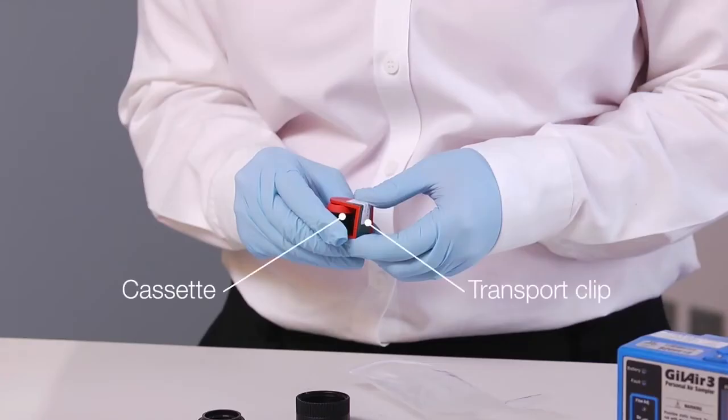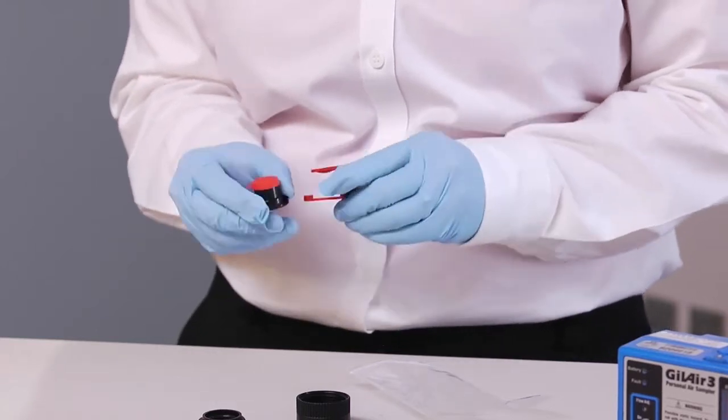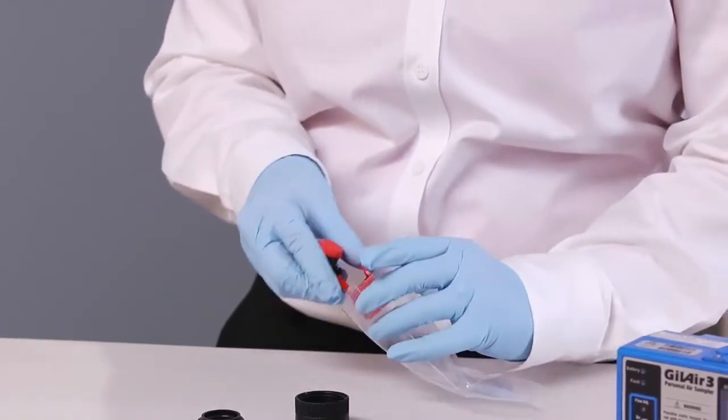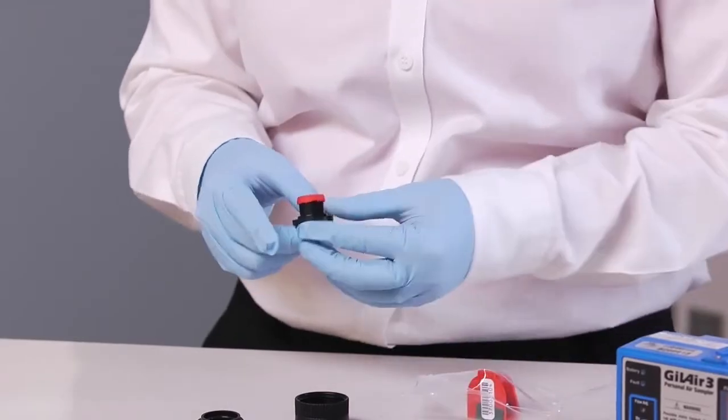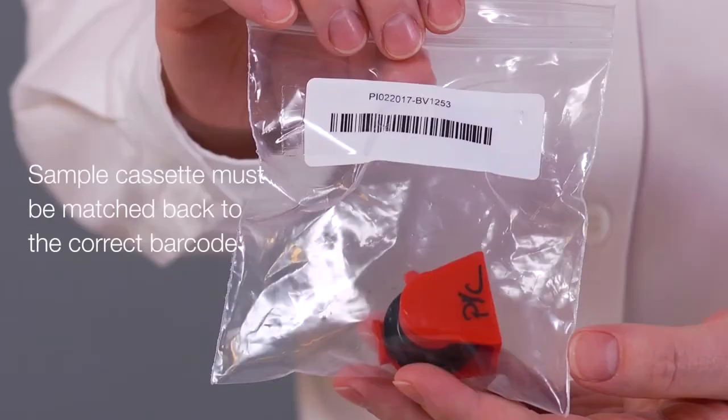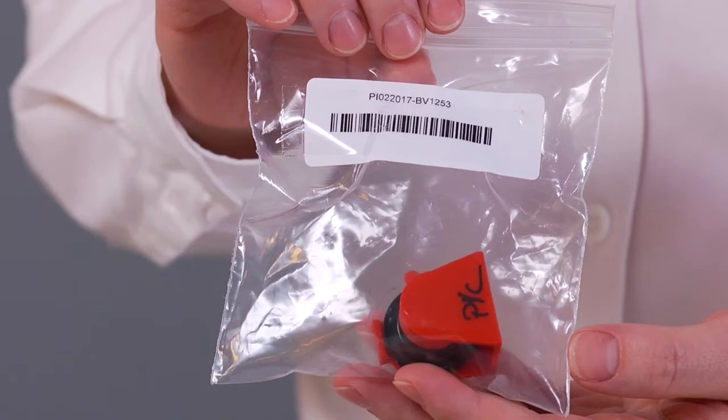Remove the cassette from its transport clip and put the clip back into the same bag for later. It is essential after sampling that if the transport clip or baggie has a barcode, the sample cassette must be matched back to the correct barcode.